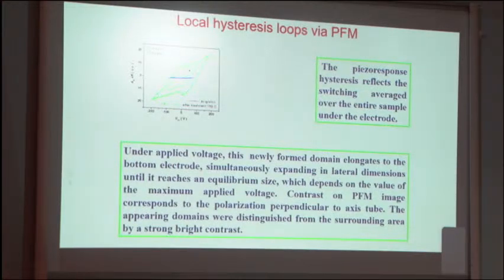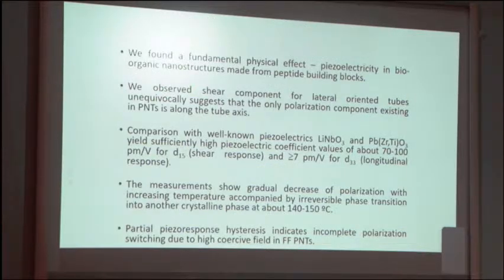As you see here, blue is the initial state. We don't have switching because the initial phase is only piezoelectric, but after heating, we have a very good ferroelectric hysteresis loop. Okay, this is the conclusion about dipeptides: we have a very strong piezo response.